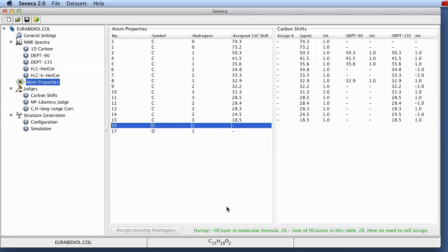Now comes the interesting part. Seneca does a stochastic search of constitution space. And while it walks through constitution space for any further details I have to refer you to our publications about Seneca. While it walks through this space it judges the fitness of the structure it is currently looking at with respect to the similarity between computed spectral properties and measured spectral properties.